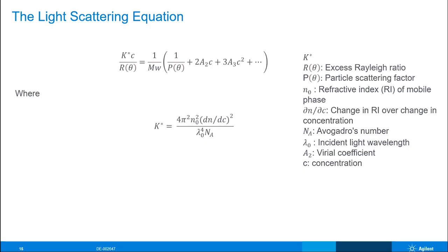I'm just showing this to highlight that light scattering really is a complicated thing, and there are a whole bunch of different parameters that we need to consider when we are talking about getting accurate light scattering. And luckily, though, we're able to simplify this in some cases. So we'll look at one of those examples coming right up. So luckily, in most cases, especially when we're talking about isotropic scattering, we're able to simplify this equation.